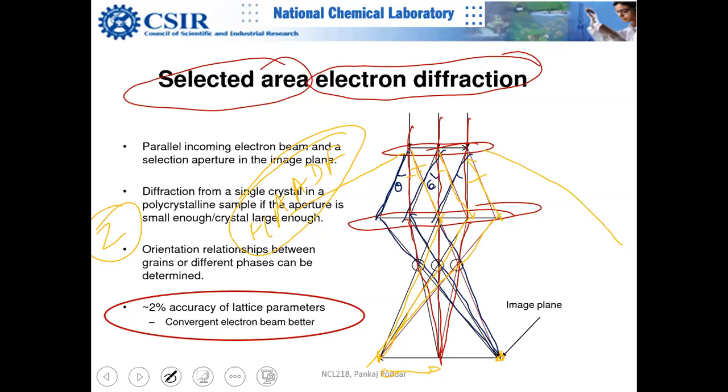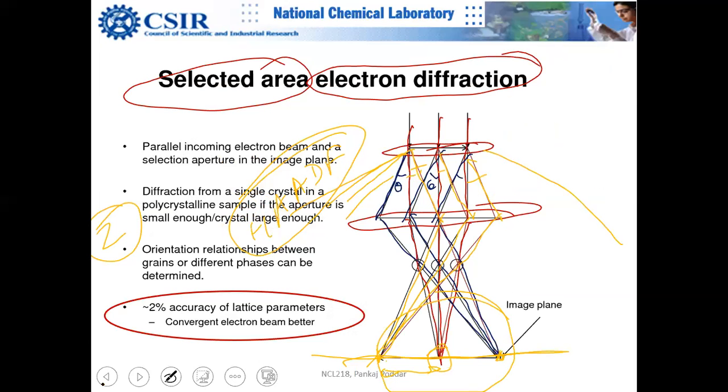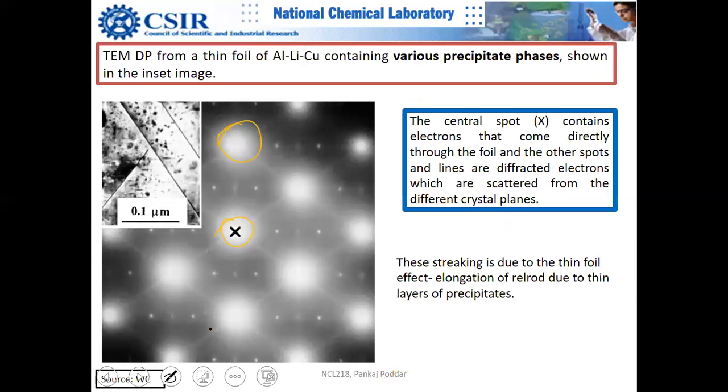Okay, because it's a two-dimensional projection, basically you can make a circle out of that. So there may be another angle theta 1, theta 2, for different planes. What I mean to say is that in the image plane, if you put a screen, then you will get something like this. Okay, this point is this point, and for example, this point is this point, and this point.